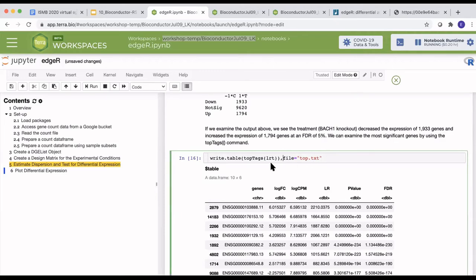No, the function name. You have the brackets closed before file, yes, but you have to remove it. Exactly. Someone posted the exact. There you go. Perfect. Okay.